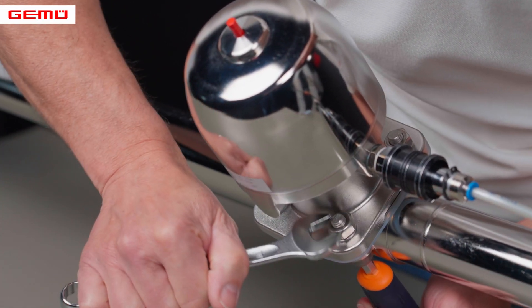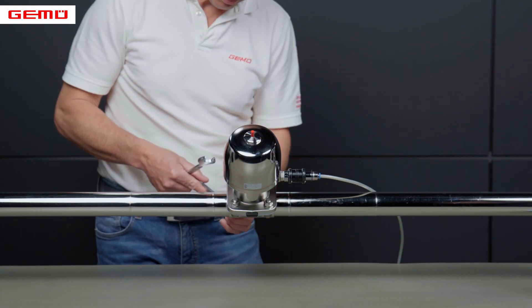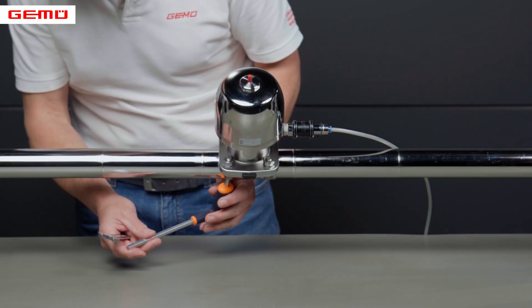Use an appropriate tool to undo and remove the screws diagonally and anti-clockwise. If the screws are difficult to turn, we recommend that you replace them.